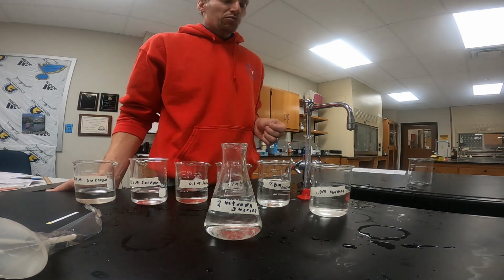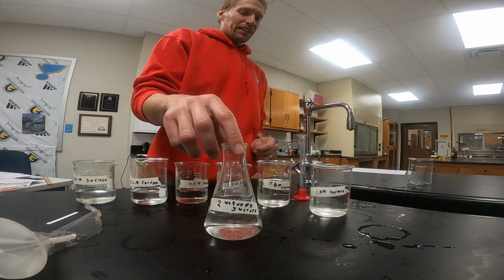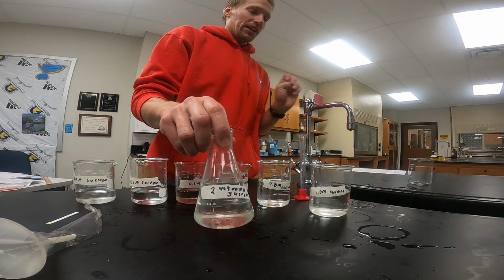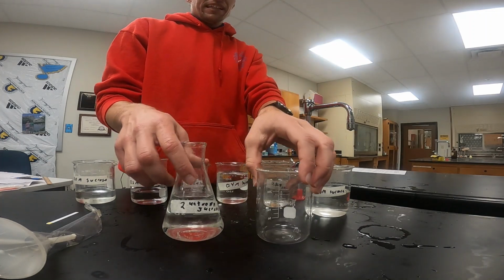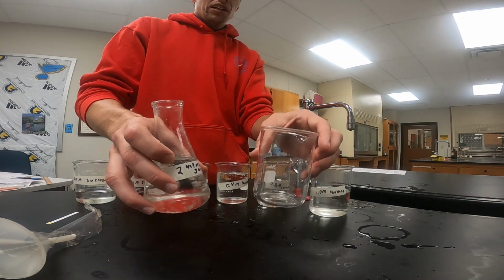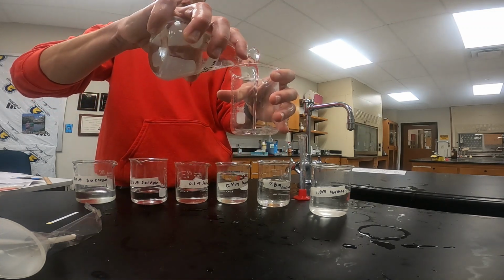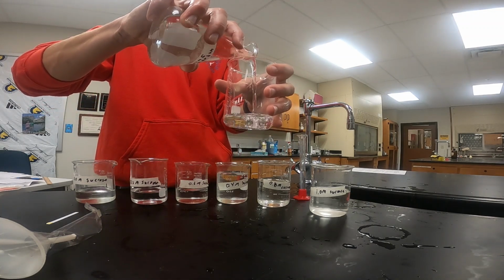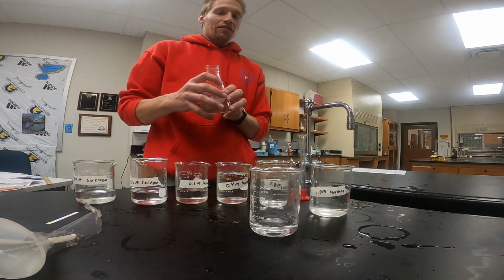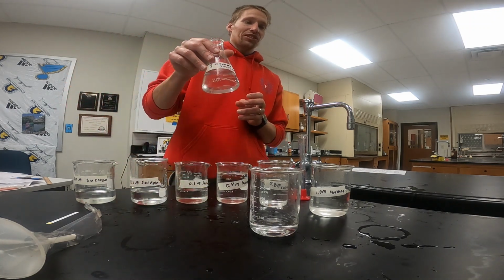Now we're going to proceed with experiment part 2. In experiment part 2, we are using a dialysis balloon. This time we start with a beaker, and we're going to place in approximately 60 milliliters of this unknown concentration of sucrose solution. Again, approximately, we're not worried about getting exactly 60 milliliters this time. So I'm just going to pour about 60 milliliters of our sucrose solution. This is an unknown concentration. We're not sure what this concentration is.